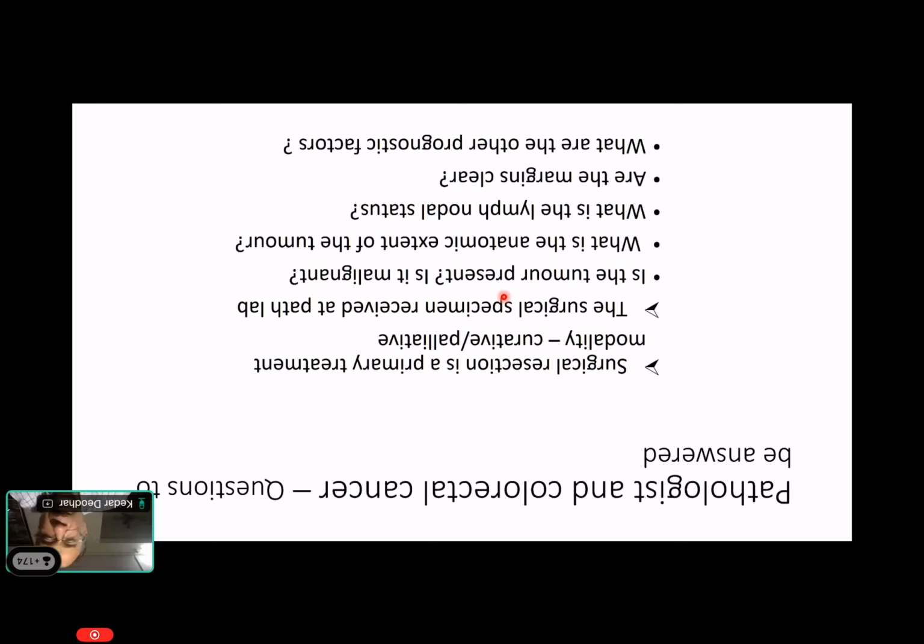So I think I'll go ahead. The report requires us to tell us: is a tumor present, is it malignant, what is the anatomical extent of the tumor, meaning T stage, what is the lymph node status, because T and N stage are most important, and the margin is actually important. Usually, our oncosurgeons will look at the margins upper in the frozen section. So, meticulous grossing is a key factor in determining the quality of the subsequent reporting.